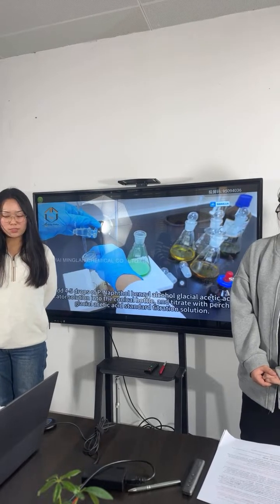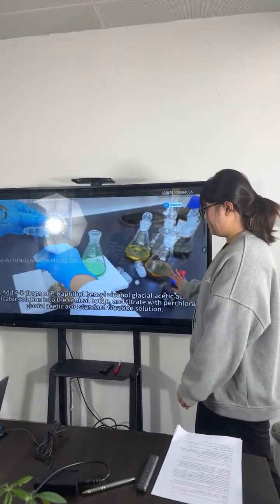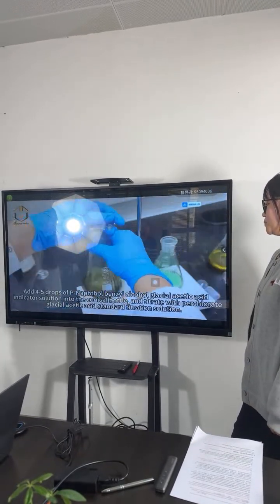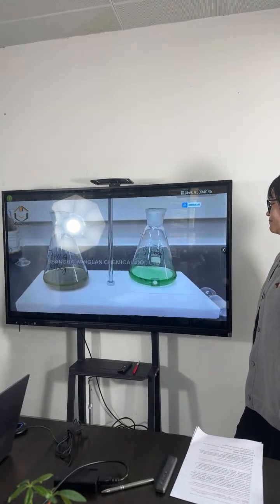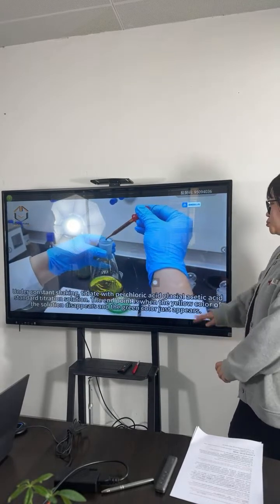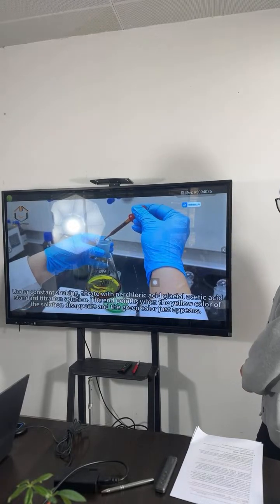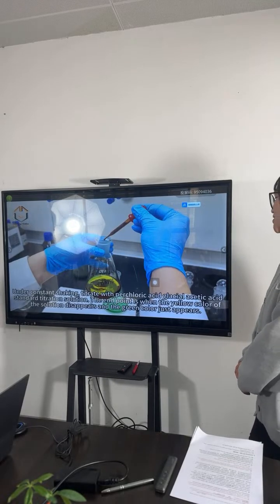And Winnie, can you tell us about the final result after adding the titration solvent? Under constant shaking, titrate with perchloric acid glacial acetic acid standard titration solution.